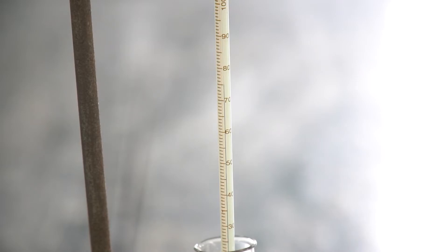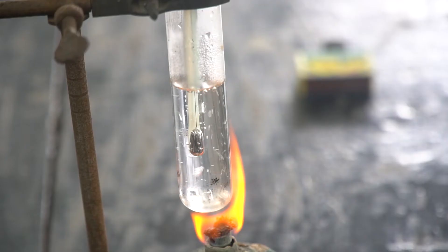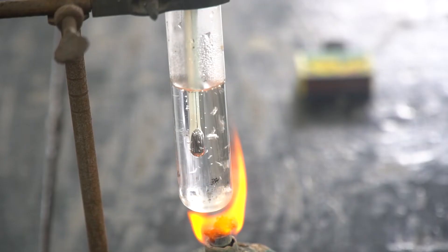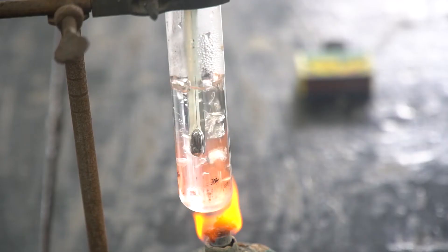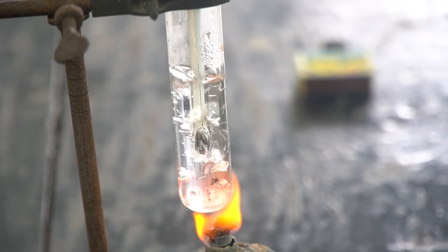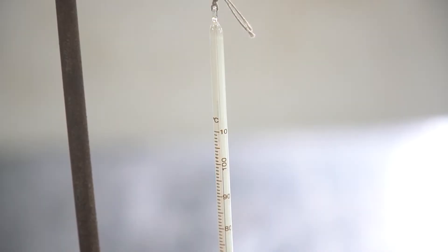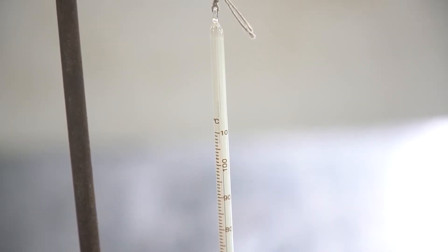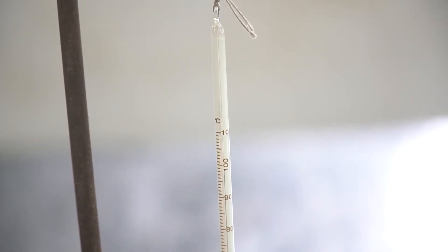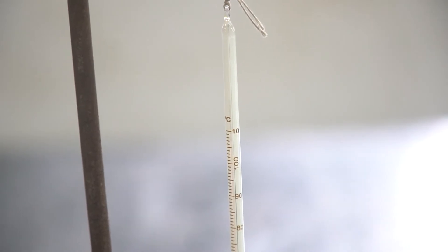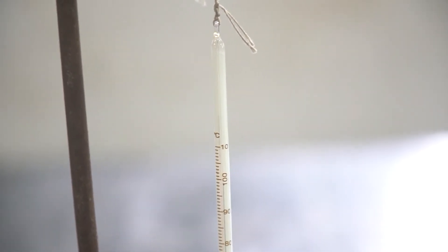In a few minutes, the water will start to boil. When the water starts to boil, the thermometer will show 100 degrees Celsius or close to 100 degrees Celsius.